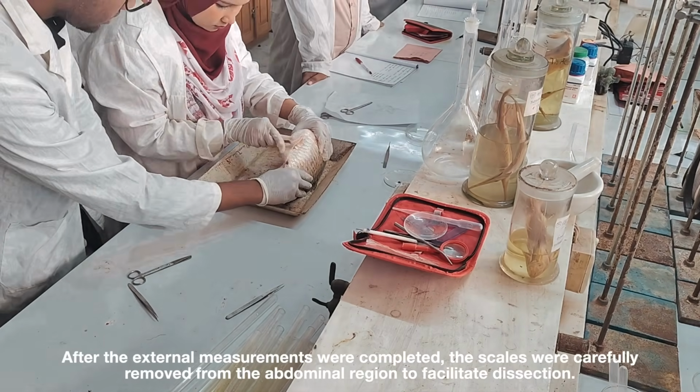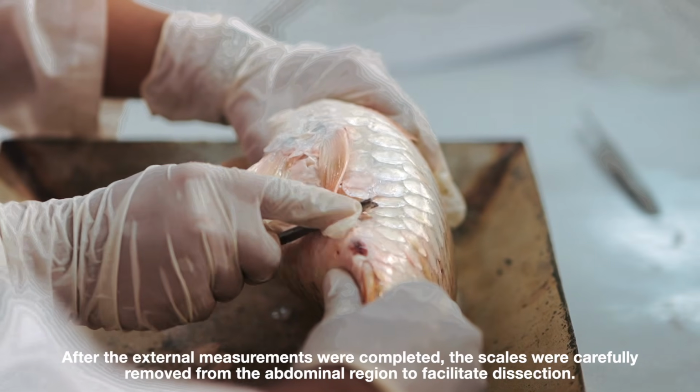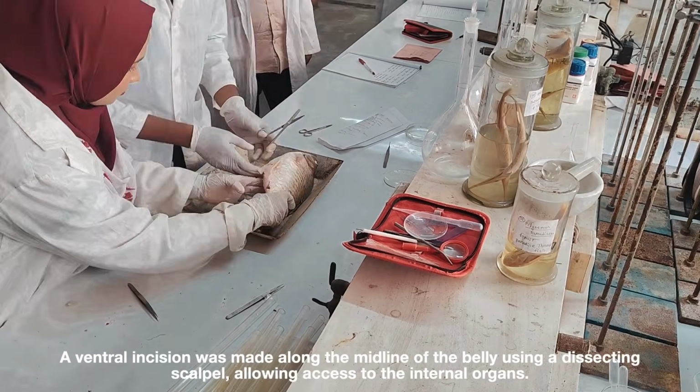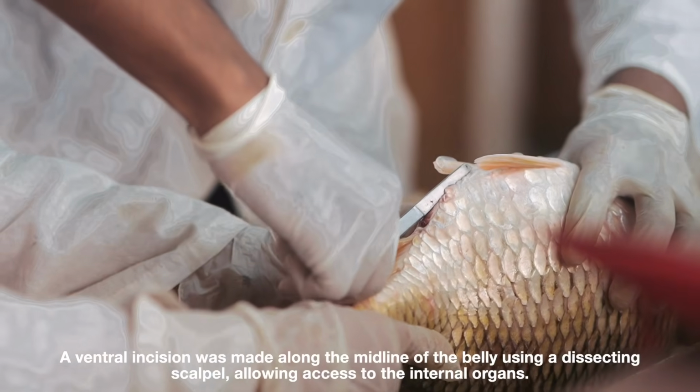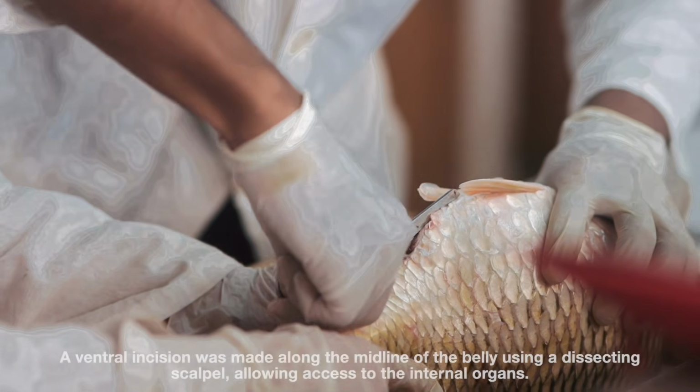After the external measurements were completed, the scales were carefully removed from the abdominal region to facilitate dissection. A ventral incision was made along the midline of the belly using a dissecting scalpel, allowing access to the internal organs.